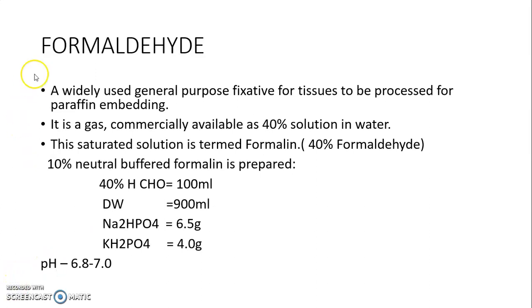So we are going to discuss formaldehyde. Formaldehyde is a widely used general purpose fixative for tissues to be processed for paraffin embedding. It is a gas commercially available as a 40% solution in water.